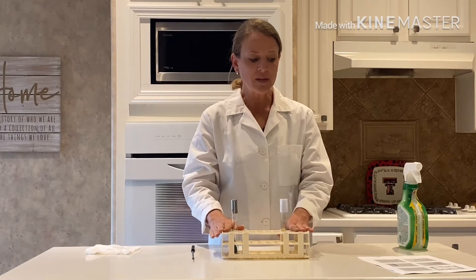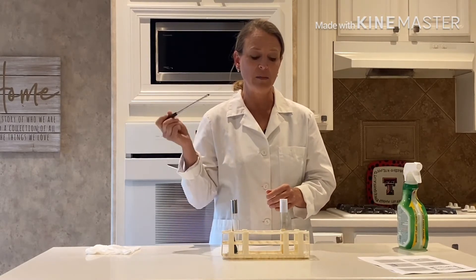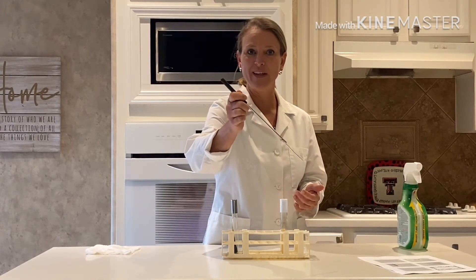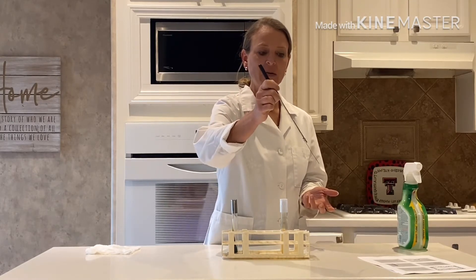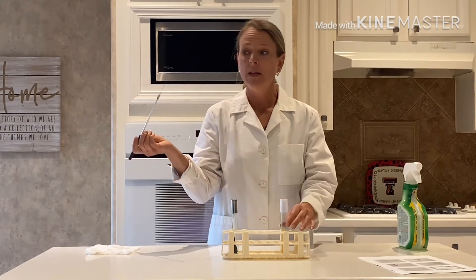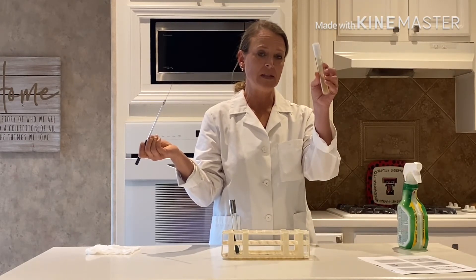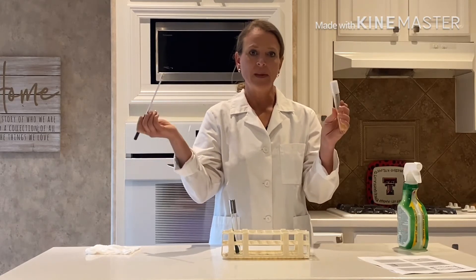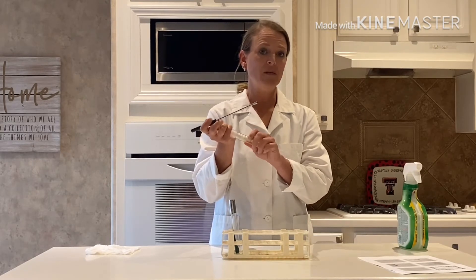In doing my inoculation, the first step is I'm going to use my inoculating loop and I am going to sterilize it. Imagine I have a Bunsen burner here — I would sterilize my loop by holding it at an angle, making sure it gets red hot, and then allowing it to cool. As it is cooling, I'm going to transfer bacteria from a slant onto my citrate agar slant. Let's imagine my loop has had some time to cool.